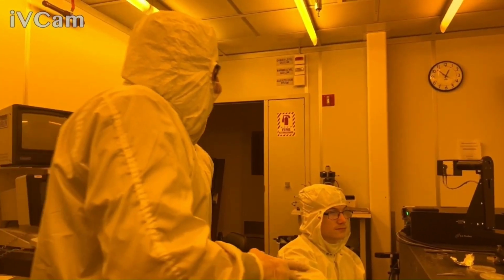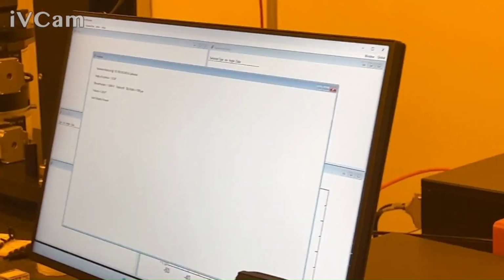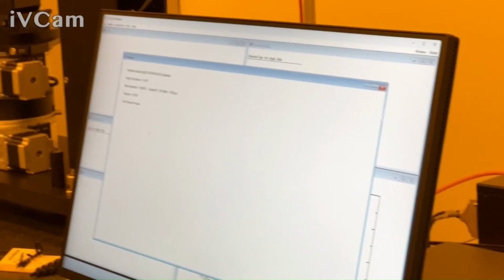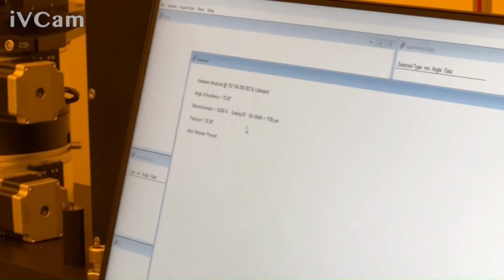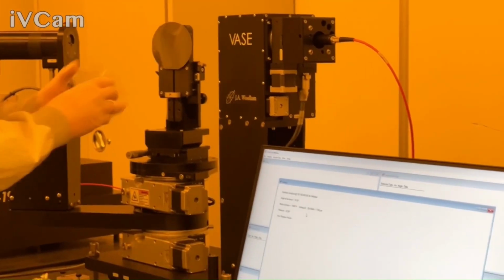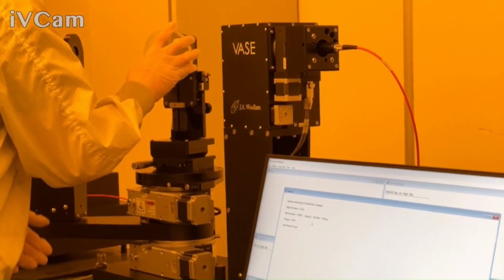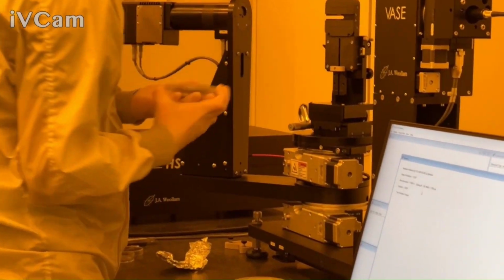While the system's up, let's do a couple quick things. So I'm going to show some manual stuff. I'll drive for a second. Yeah, that's fine. So in general, right now, let's go ahead and pull off the sample for a sec. Okay. And so I just hold it up there, and then I turn off the vacuum, and make sure it tips into the container so it doesn't just drop. Perfect.